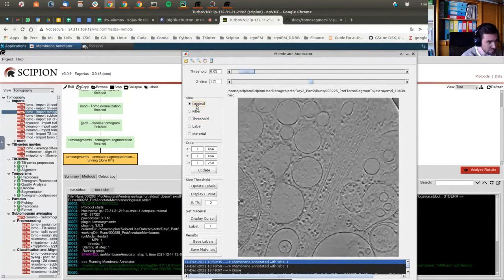Once here, just as a quick recap, we have to place the value 0.05. Mine is not restarting. Maybe after the double click on the tomogram list, it takes some seconds to display. I'm asked whether I want to restart the workflow. Okay, Patricia is going to connect to your machine and help you. Okay, thank you.